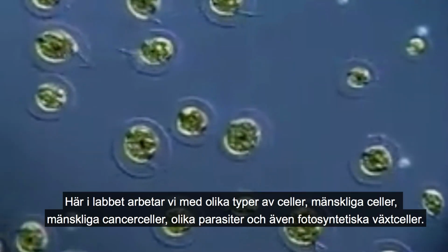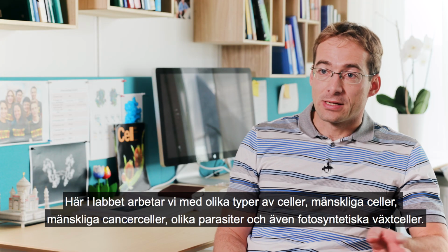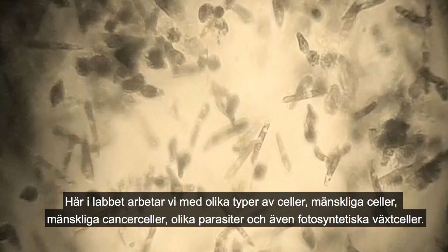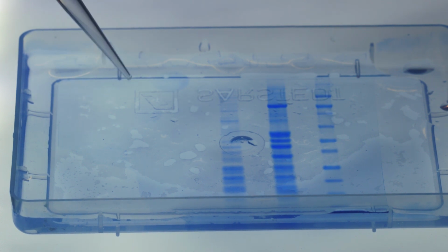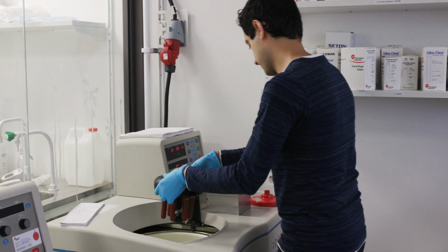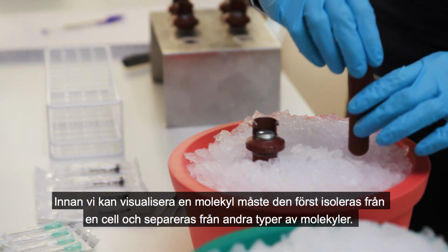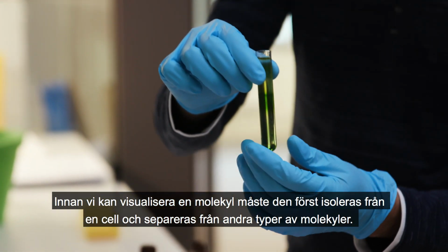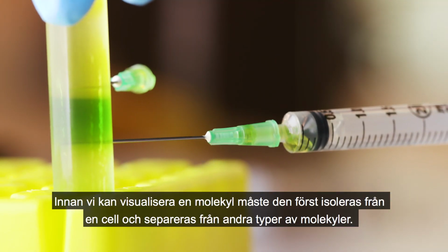Now, in the lab, we work with different types of cells. Human cells, human cancer cells, different parasites, and also plant photosynthetic cells. Before being able to visualize a molecule, it first should be isolated from a cell and purified from other types of molecules.